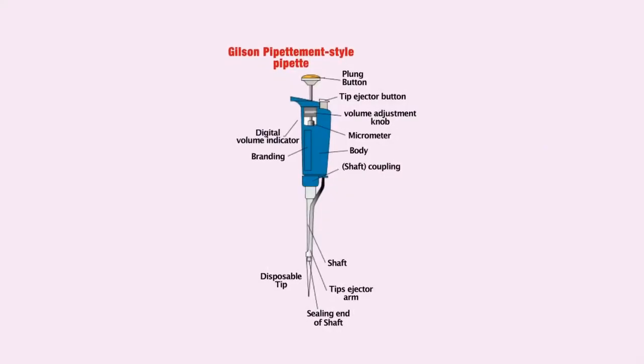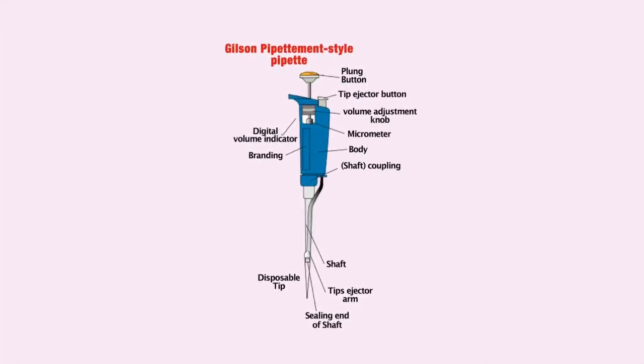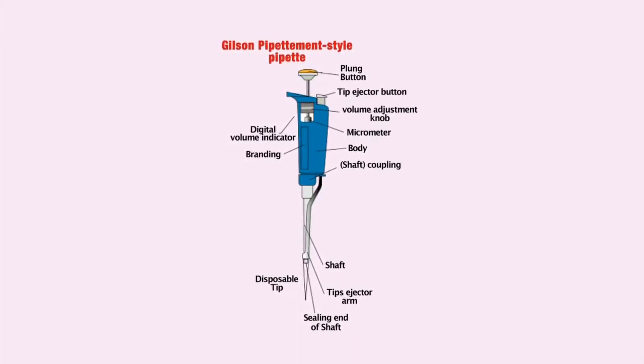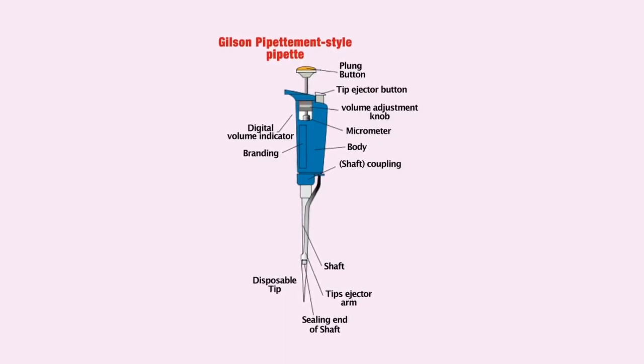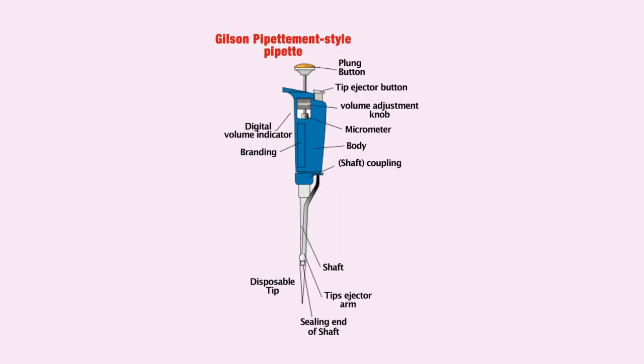The next is micropipette use. Micropipettes are used to measure and transfer small volumes of solution or liquid. These small instruments have a screw for adjusting the volume of air space in the barrel and work by screwing the plunger in or out of the piston. They also have a digital display readout that displays the corresponding volume.